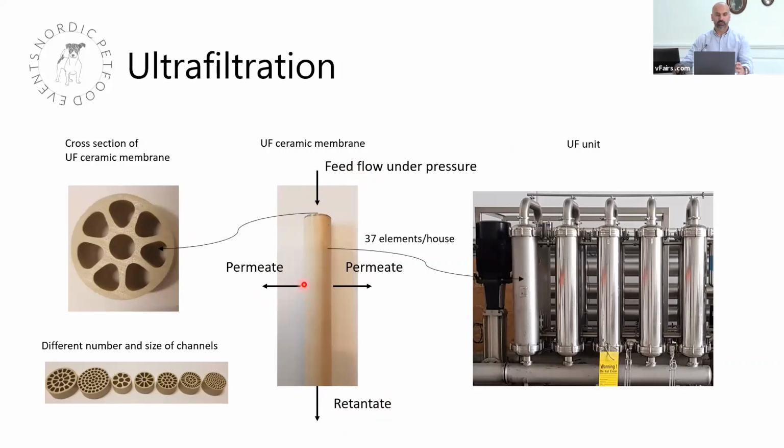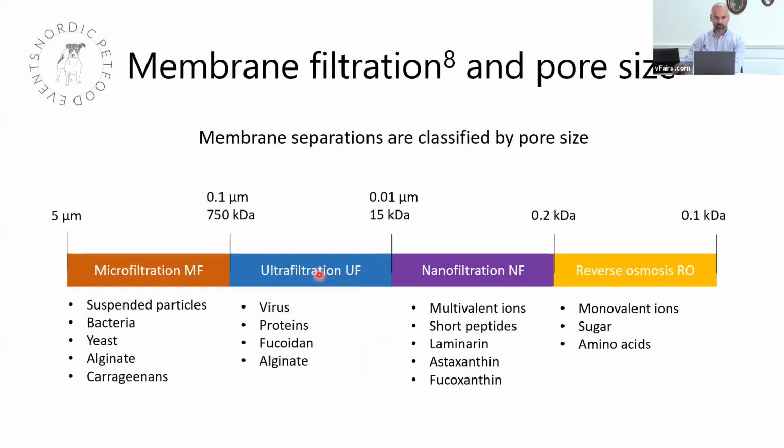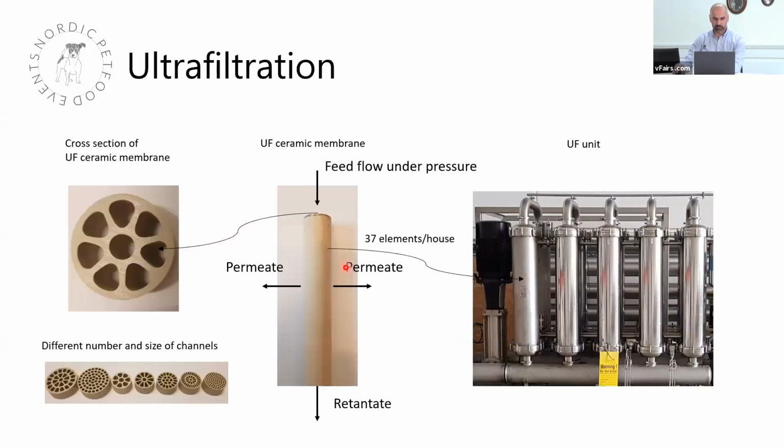But since pressure is applied, we will be able to squeeze something through the walls of the membrane, which is actually the filter. That is called permeate. So the pore size of these membranes is important, and what will follow with the permeate, for example in an aqueous solution when we press it through. It depends on the pore sizes or the type of membrane we use.